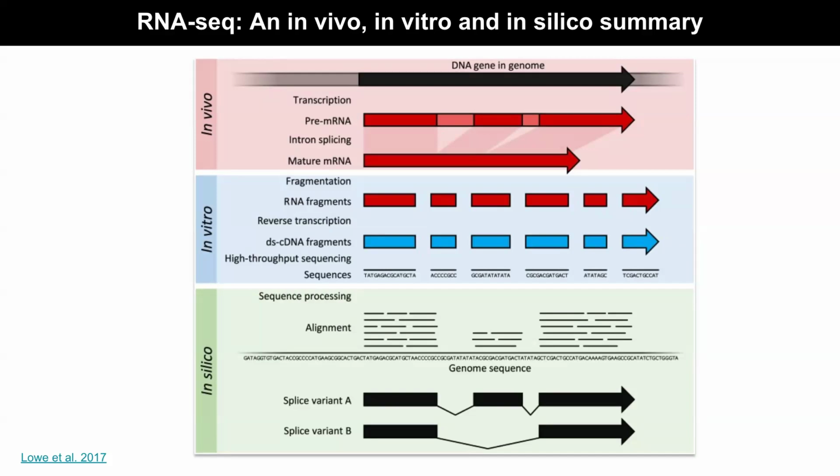You can fragment it, convert it to cDNA, or convert it into DNA, or convert it into complementary DNA. Then you get these sequences and do the exact same thing that you did with your previous data, which is that you align. Okay, clear? Technology is clear? Yeah.